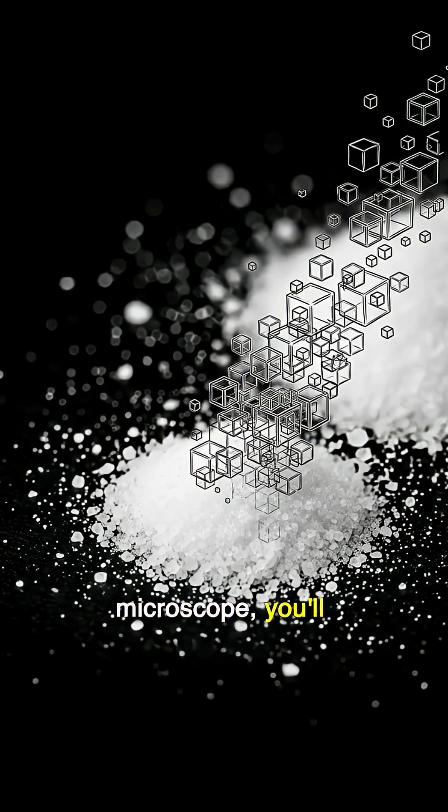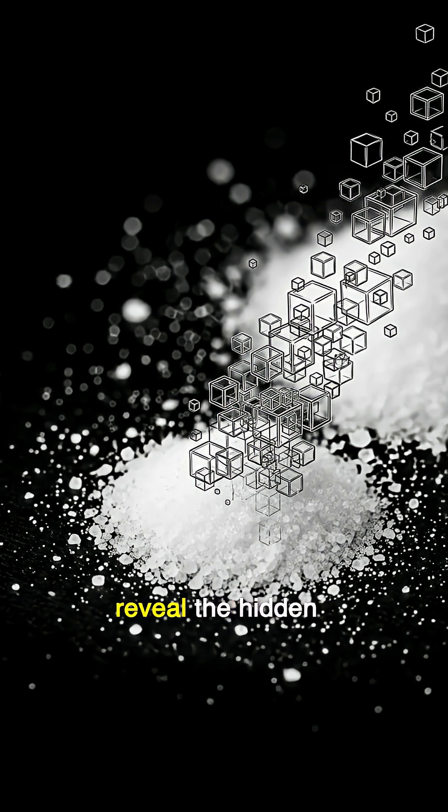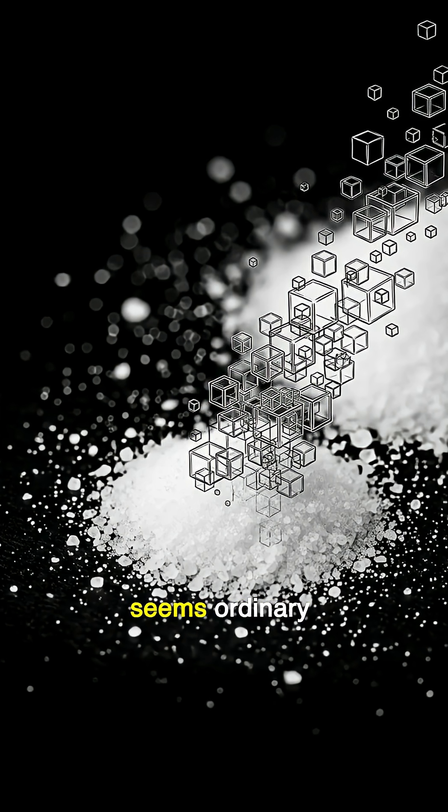But under a microscope, you'll see crystals forming perfect cubes. These shapes reveal the hidden order within what seems ordinary.